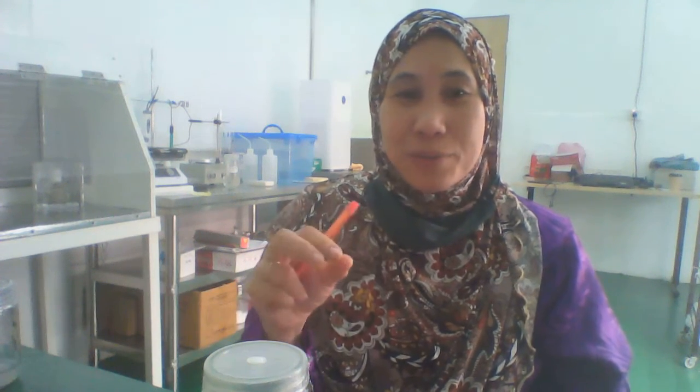So even though there was fungus in the first culture, it didn't spread into the media. It just stayed around the culture until I thought it was callus. So when I changed media into the one without ppm, the fungus came out, and I subcultured into 2 different bottles, and in a few days the fungus all went out and spread through the media. So I try to salvage this one, and I don't know whether it's going to work, but I think the chance is really narrow, but I just want to see my luck.